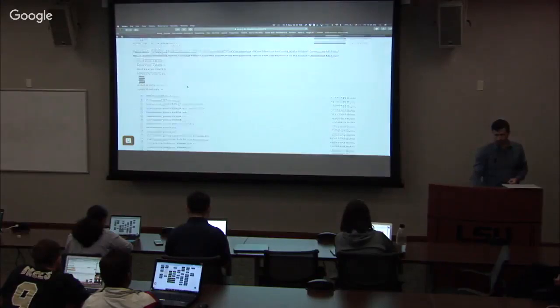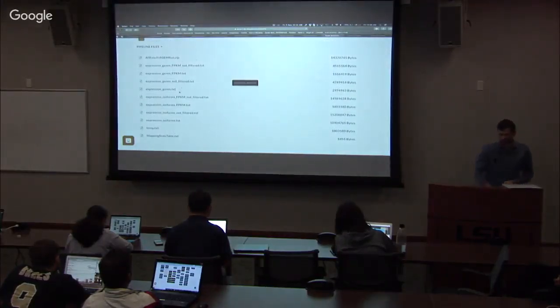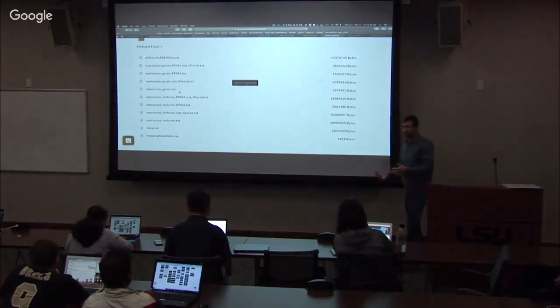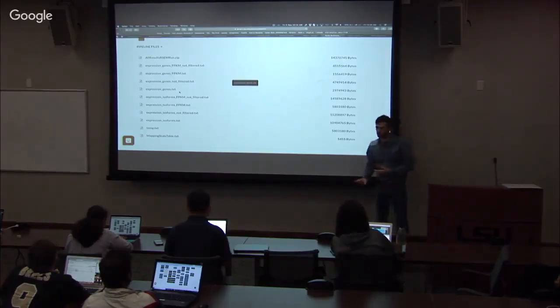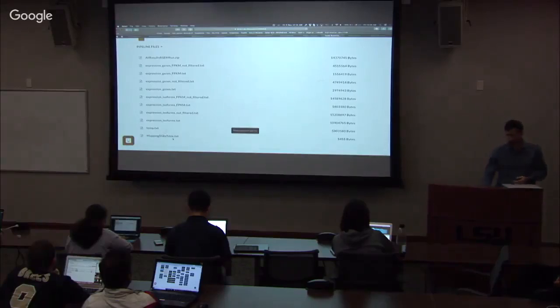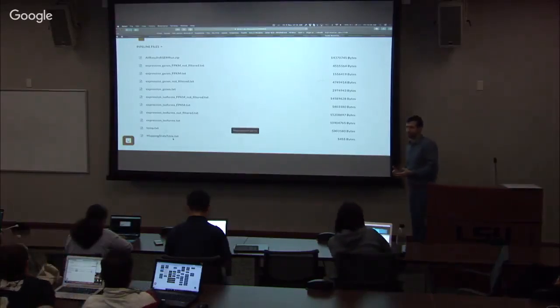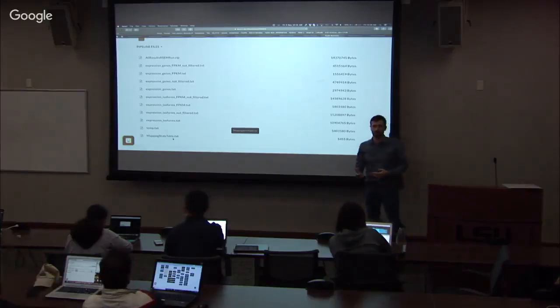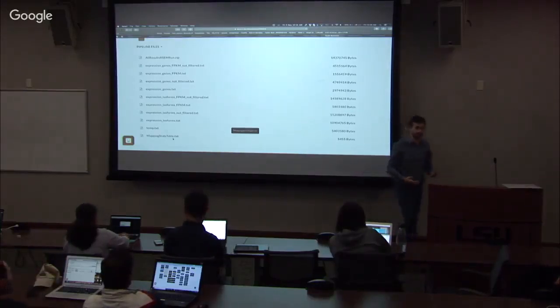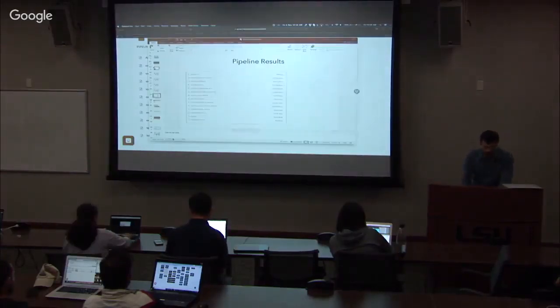But this is what you will see. If you open download files, you will see several things. Expression of genes, FPKM, filtered and not filtered. Expression of isoforms. And then you will also see mapping statistics. So these would be mapping statistics, how many reads were mapped in each sample. And you can see a variation there, and of course that will affect what we are trying to measure.